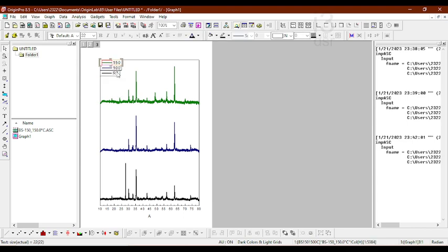And then let's say we will make the description of each data later. So this is the plain graph. So we have got all these. I want this to be a little brighter. So I click on this. Once the blue boxes appear, I click bold. I increase it to 22. Yes, it is good. And the axis is 2 theta.